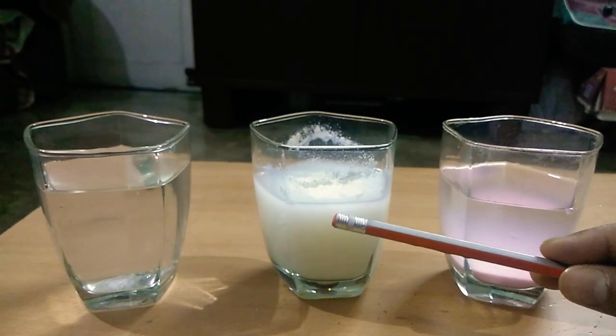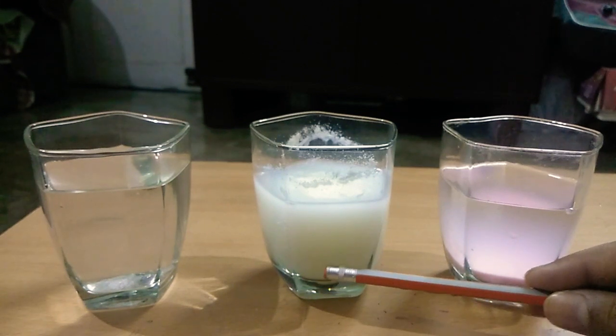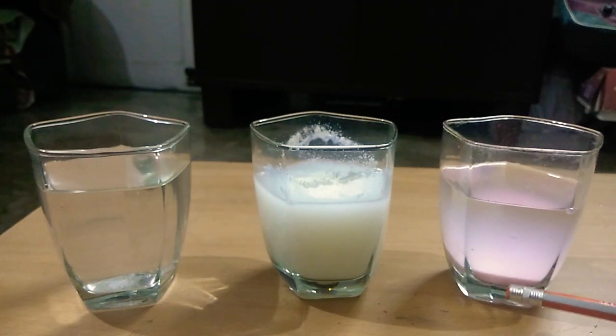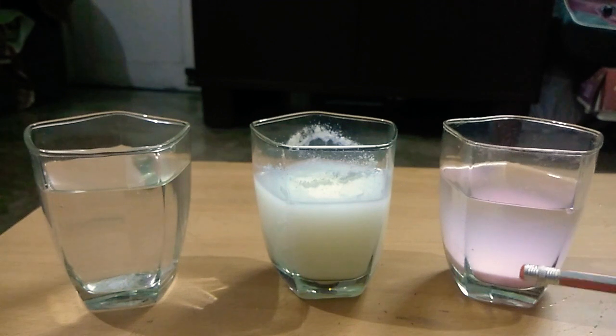Fat particles are lighter, they will remain on top, and milk proteins are heavy, they will occupy the lower position. So they are actually heterogeneous, but appear to be homogeneous. And here you can clearly see the heavy particles have settled down, and on top we have clear water or clear solution. So it is heterogeneous, it is not uniform mixing. That is the first difference.